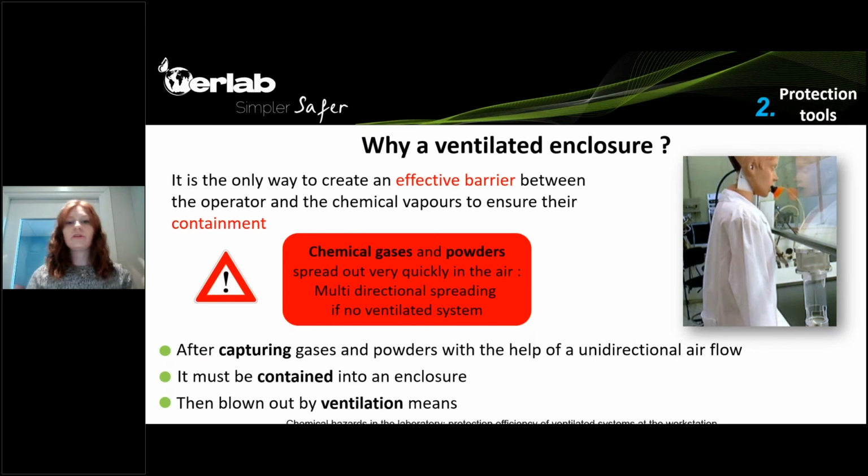So the ventilated enclosures allow capturing gases and powders with the help of the unidirectional airflow, and they allow containing all the chemicals in an enclosure and blowing them out by ventilation means.